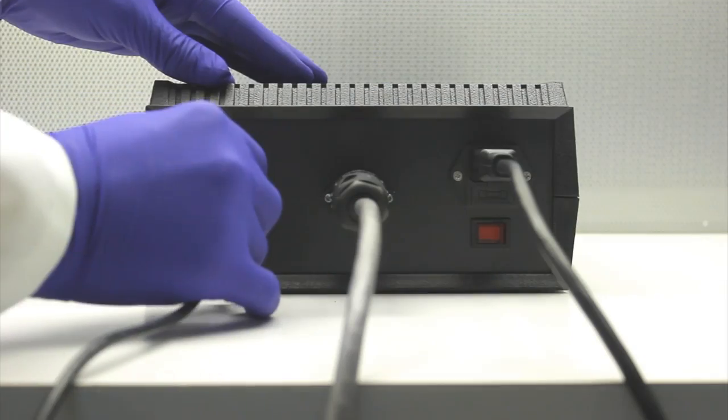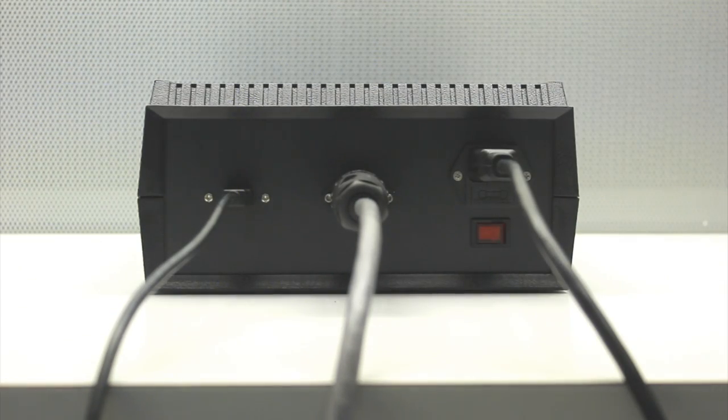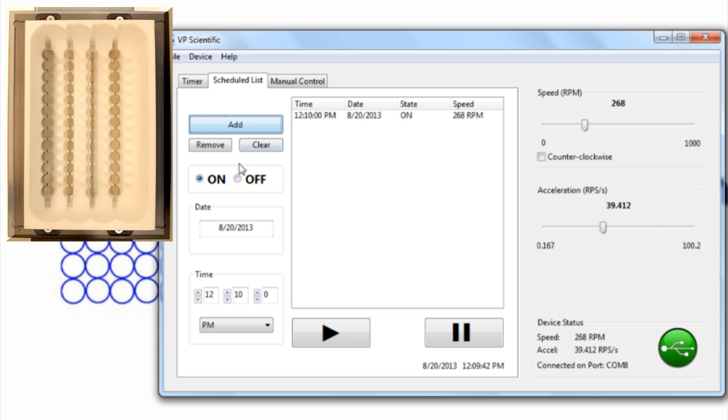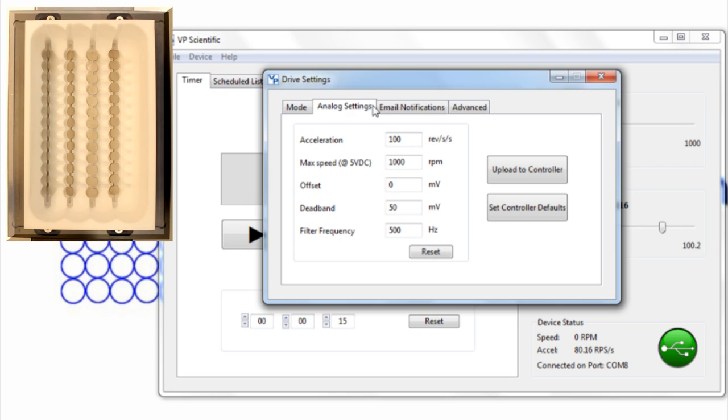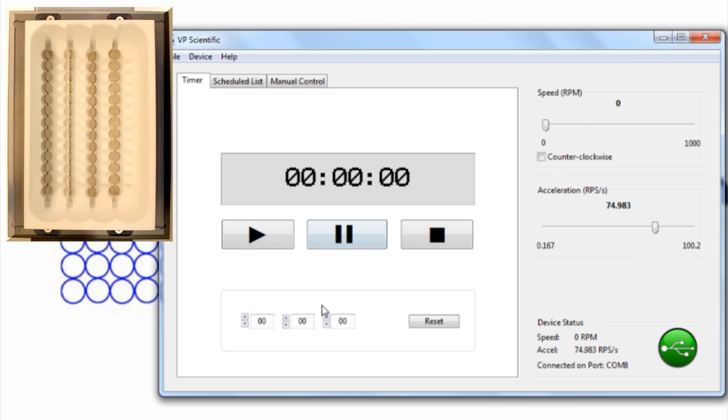They can also be controlled by computer, making it ideal for robotic integrations. This easy-to-use software allows users to set up schedules and timed runs, receive email alerts, determine acceleration and deceleration rates, determine and record precise RPM speed, and many other functions.